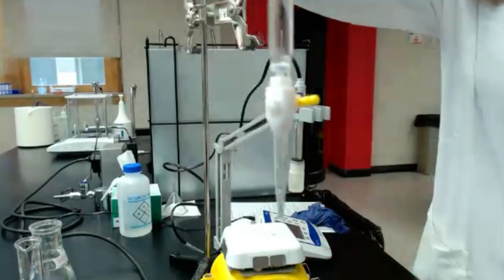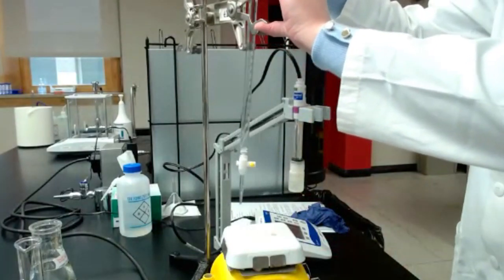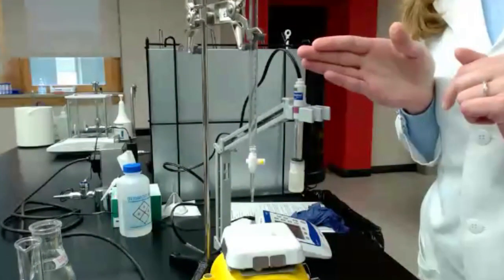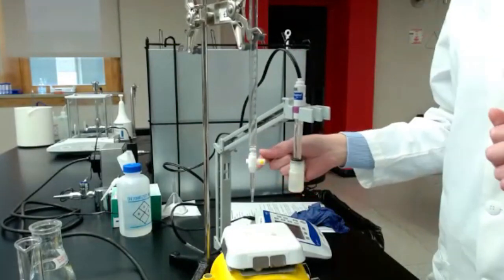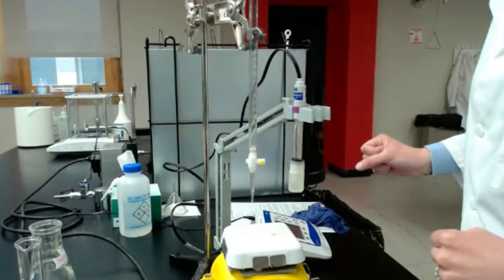If you have that, make sure you have the burette on a stand, because that burette should always stay straight. If it's not straight, you're not going to have the appropriate sodium hydroxide concentration solution.